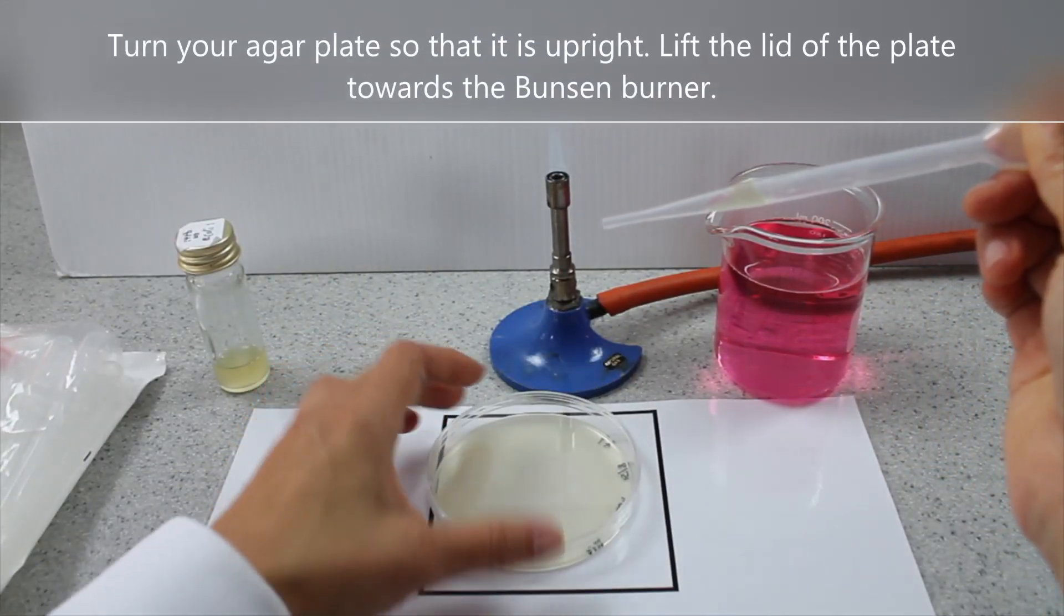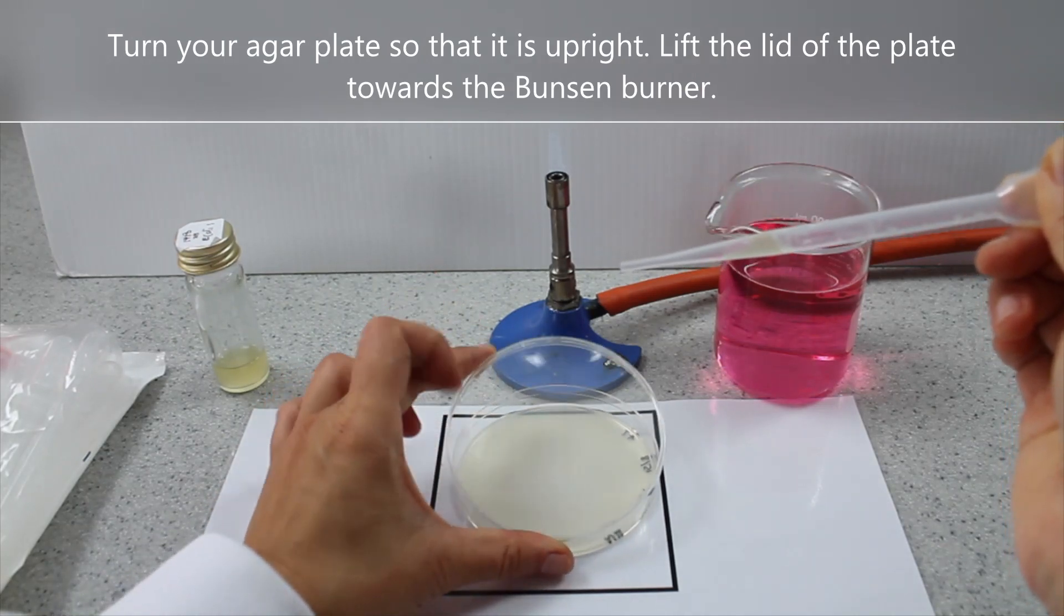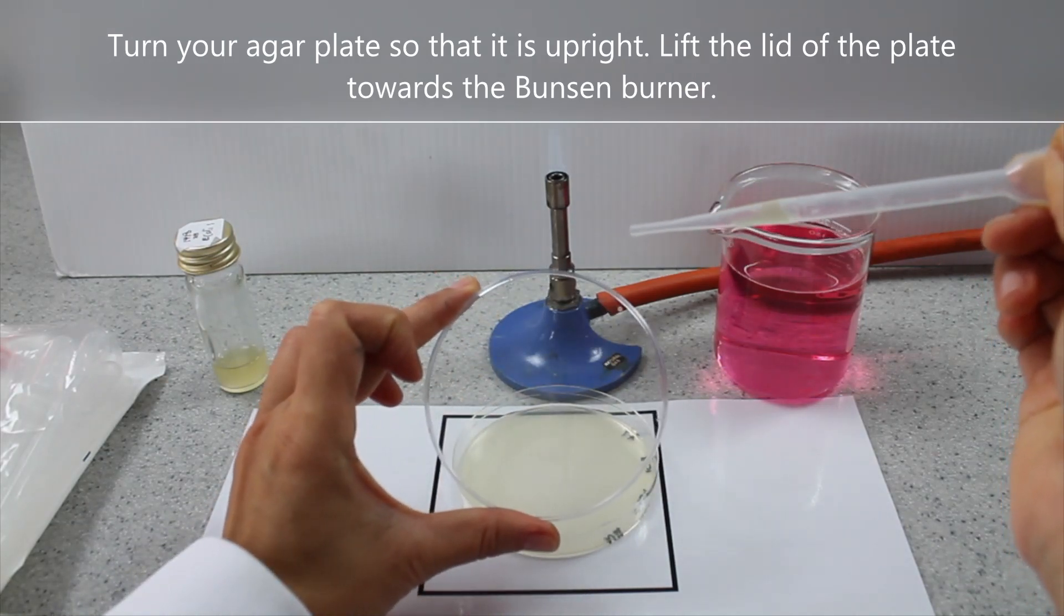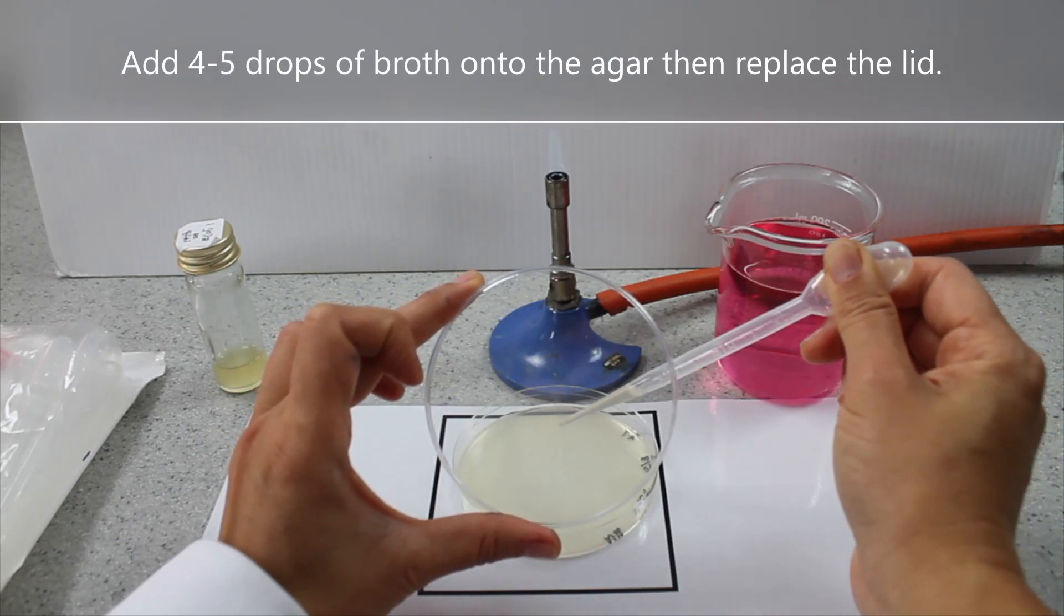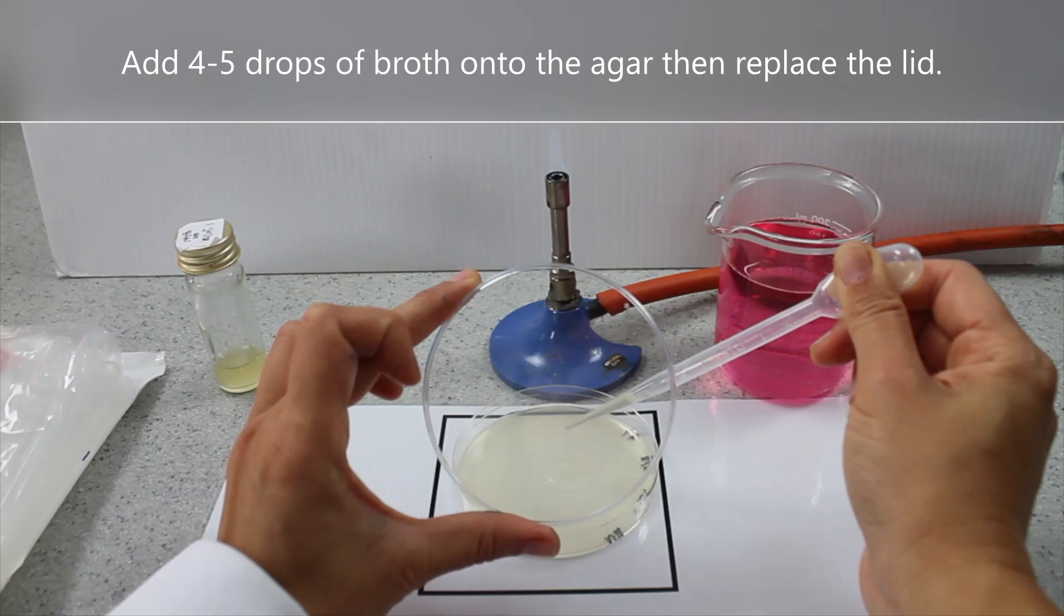Turn your agar plate so that it is upright. Lift the lid of the plate towards the Bunsen burner. Add four to five drops of broth onto the agar then replace the lid.